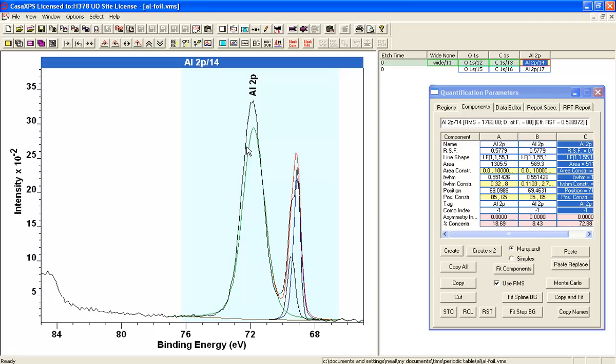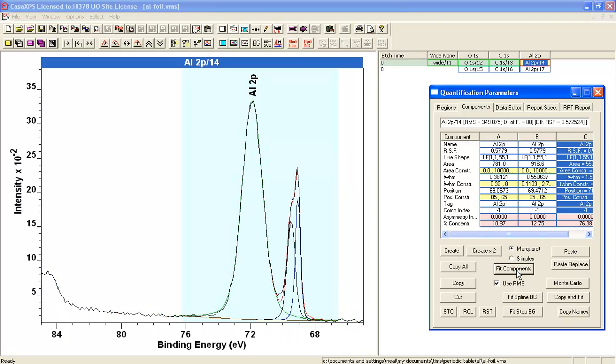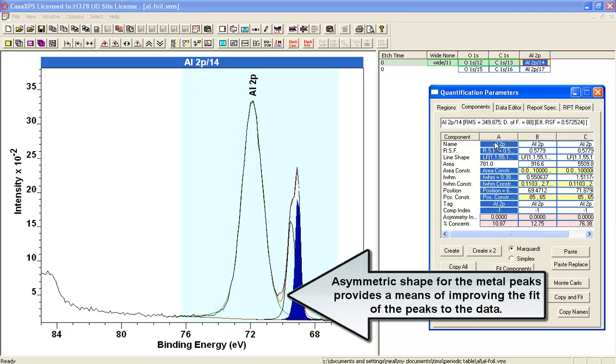So I'm adjusting the oxide peak and then I say fit, and we get a peak model here which is fitting to the data using the three synthetic components. So these two are metal.